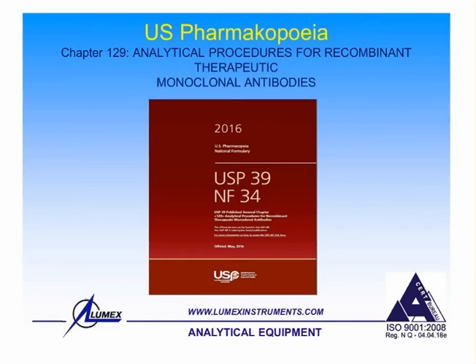Last week, I came back from the installation of this instrument in one of the big pharmaceutical companies in Portugal, in the city of Porto, where people purchased CAPEL specially for the analysis of monoclonal antibodies.